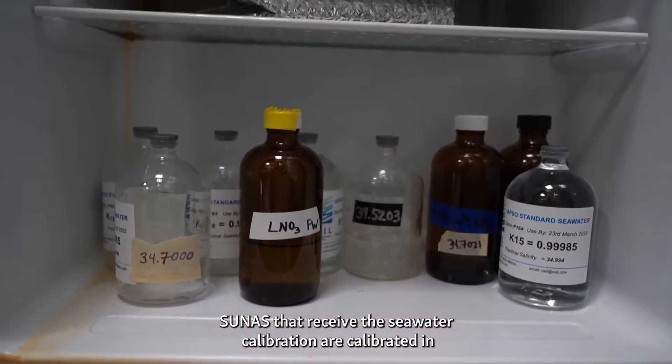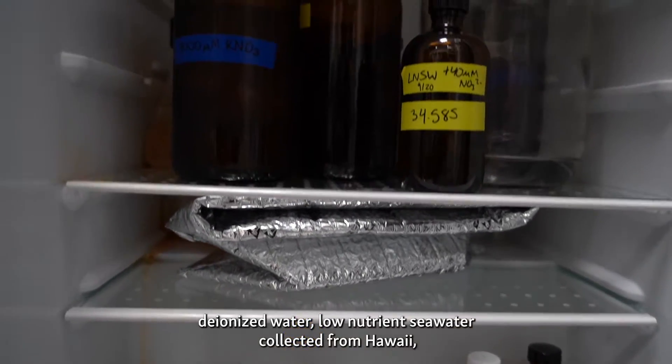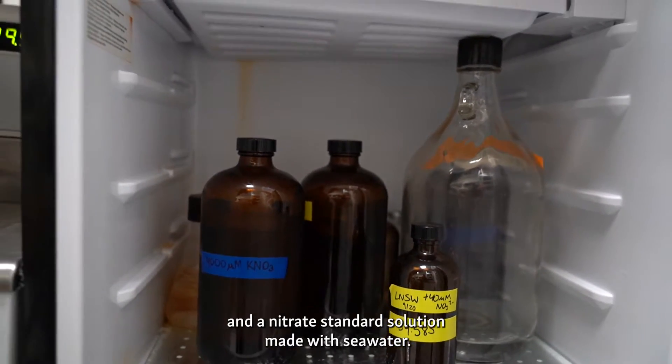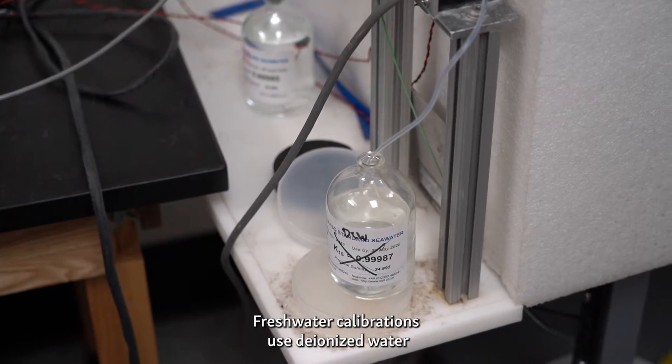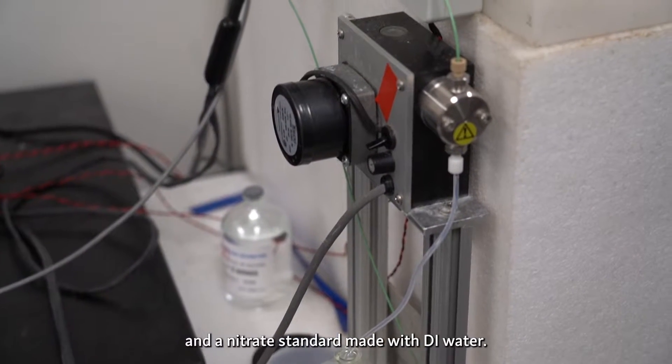SUNAs that receive the seawater calibration are calibrated in deionized water, low-nutrient seawater collected from Hawaii, and a nitrate standard solution made with seawater. Freshwater calibrations use deionized water and a nitrate standard made with DI water.